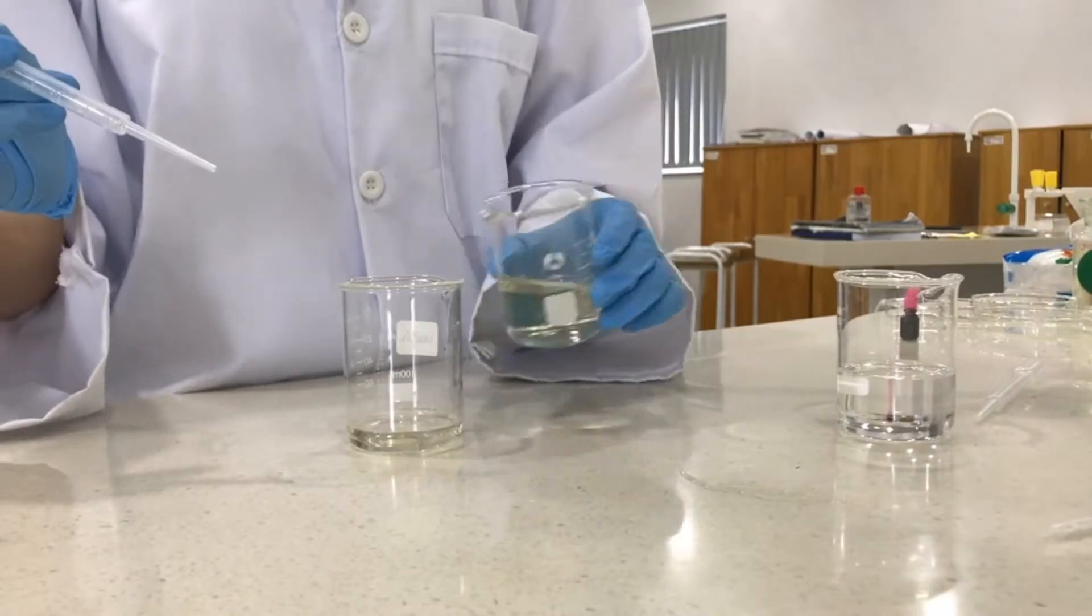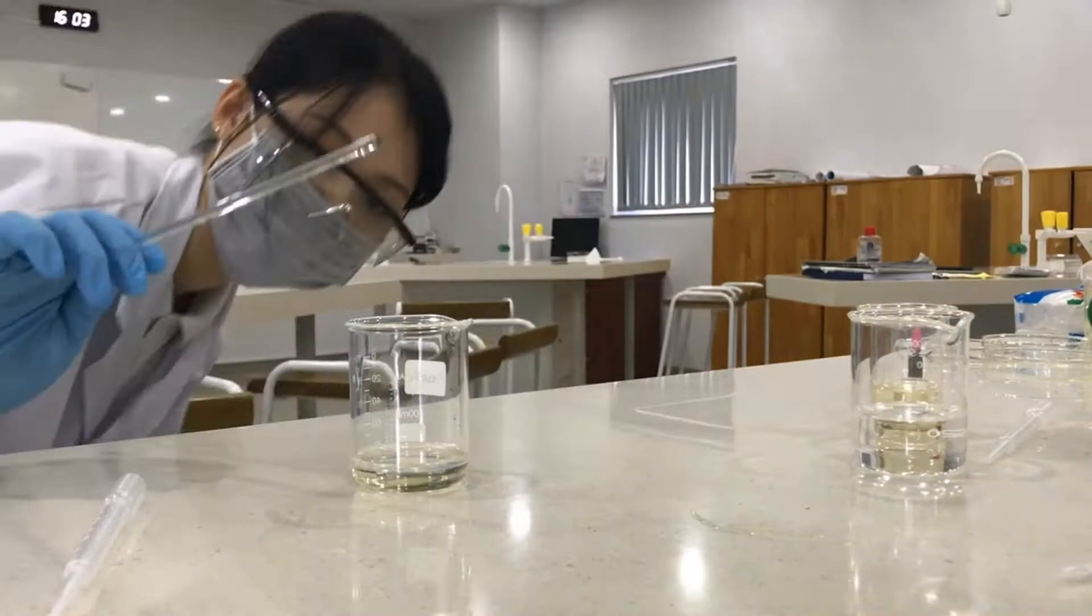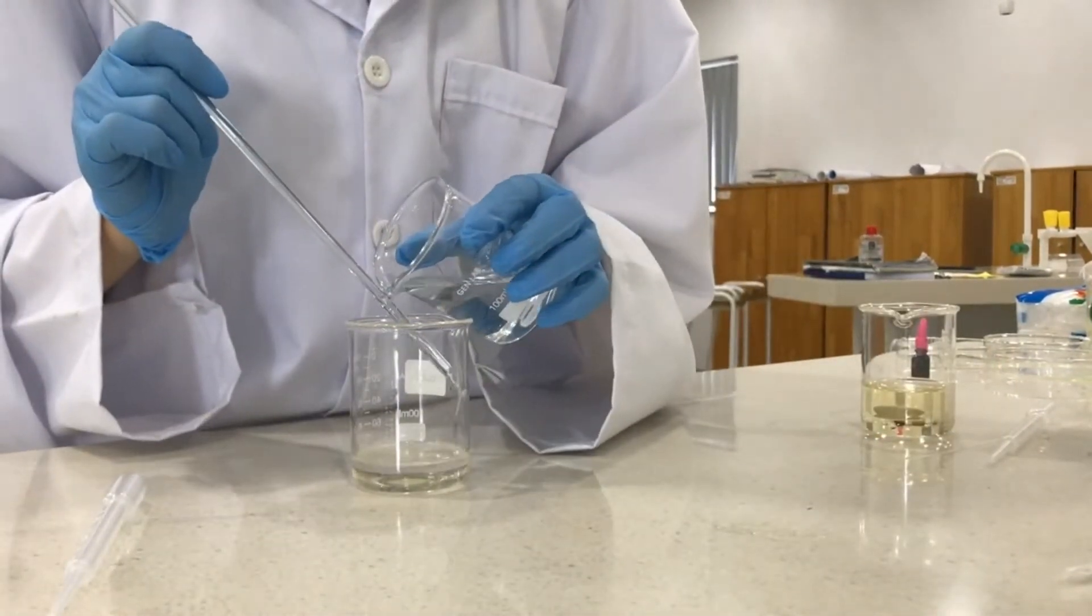Next, pour the aqueous diamine solution and then the cyclohexane solution of acid chloride on top. To minimize mixing of two solutions, pour the second solution down the glass rod.